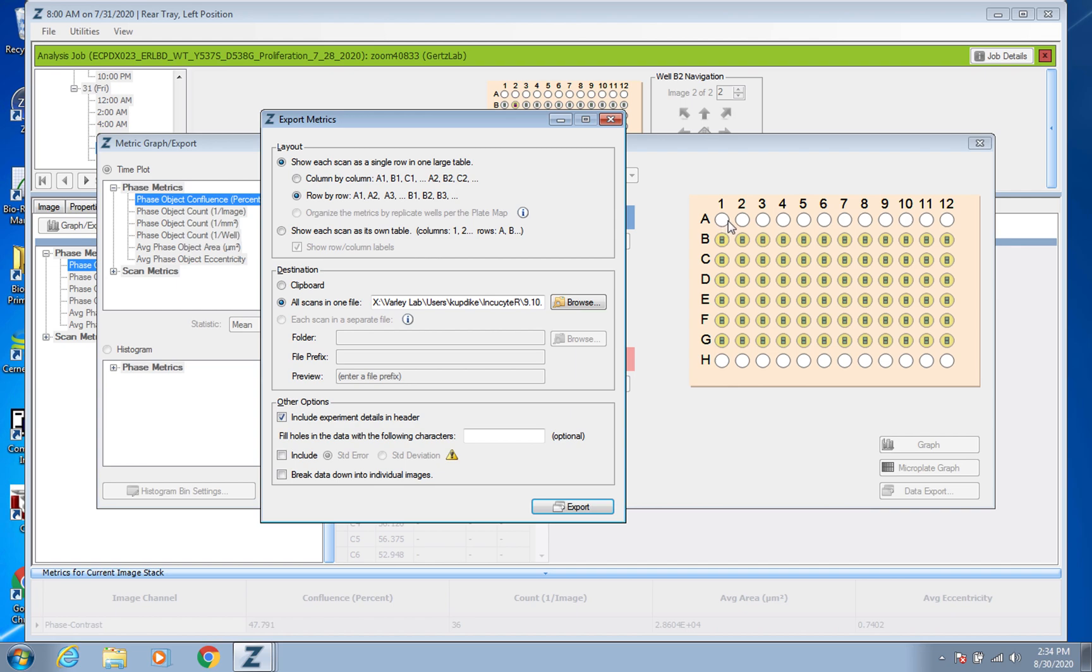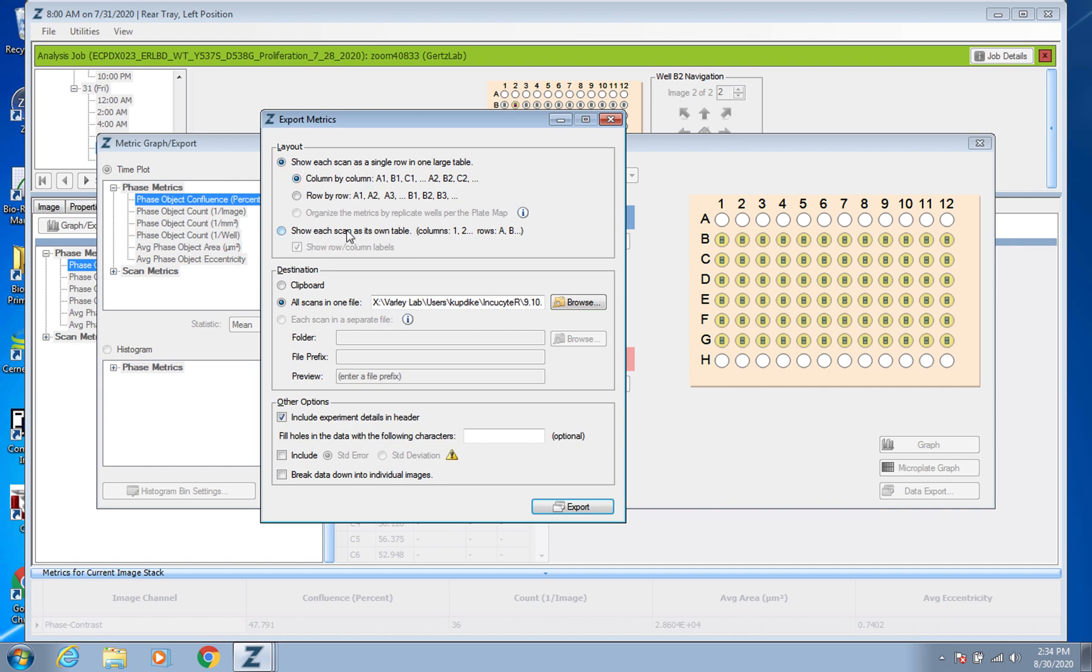A lot of times if you set it up that maybe these ones are all the same like A1 through 4 and then A5 through 8 or something. But if you did set it up differently you could always pick it to do column by column. But you do want it like this, you don't want the Show Each Scan as Its Own Table.